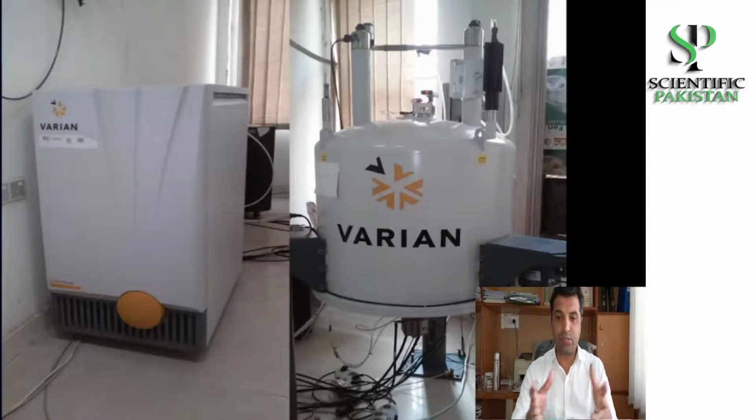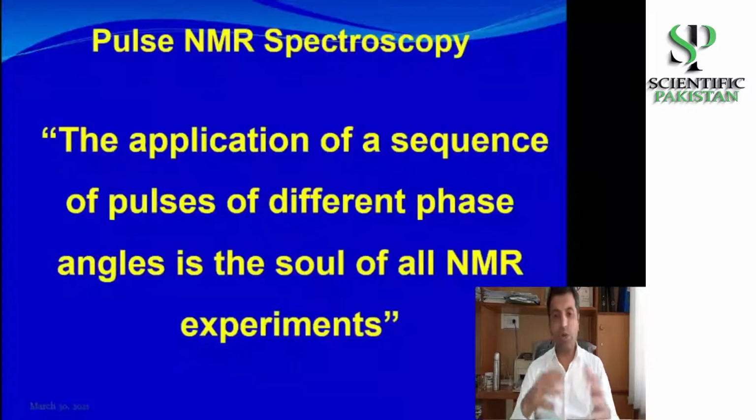And now, because this pulse Fourier transform technology is connected with computers, there are softwares that can operate these machines, and you can do everything in an automated fashion. So what is pulse NMR spectroscopy? It's a sequence of pulses that we give in all of these different experiments.